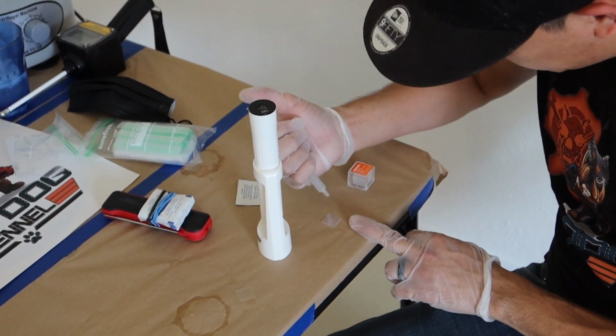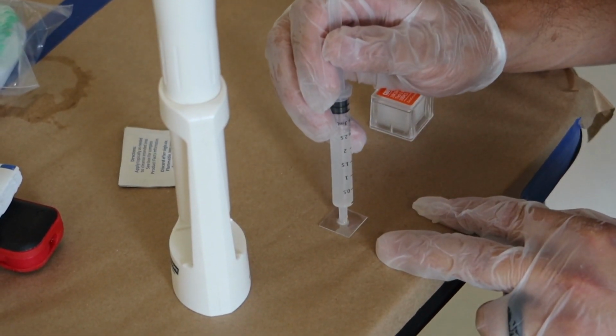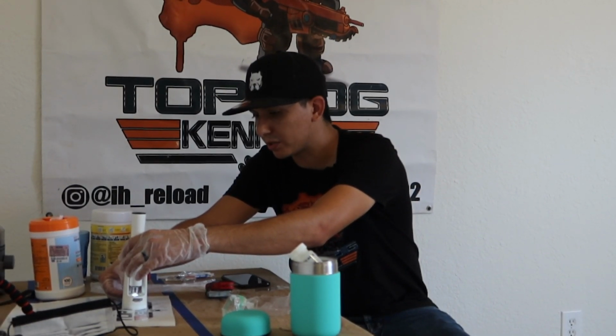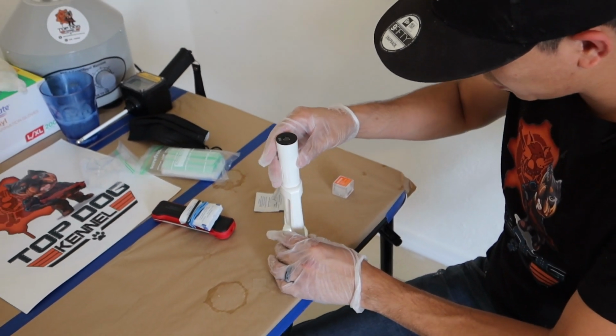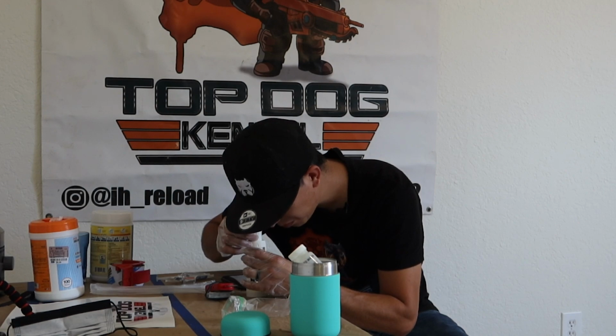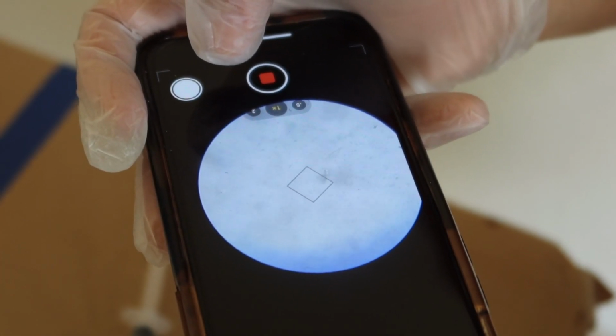What we're gonna do next is put a drop on the slide. If I could get this open, there we go. We'll put 1 drop on the slide. Spread it out just enough. And what you want to do is put it right underneath the microscope. Once you put it there, you want to go ahead and focus and bring the little cells into frame. Okay, perfect. Looks like a great sample.